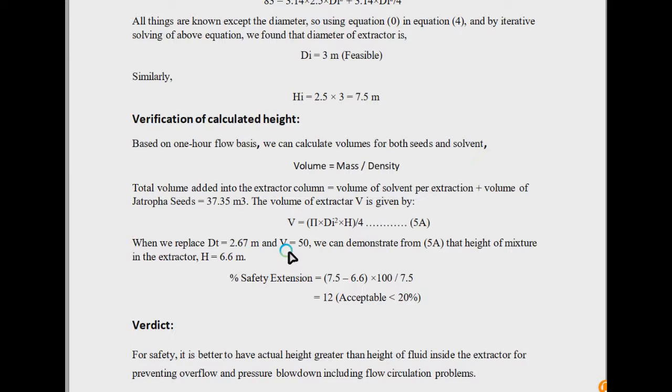First of all, for the extraction, you have this relation: the concentration of oil extracted at any time for each experiment, based on the equilibrium concentration, is calculated using this relation. Yt is equal to Cl times the volume of solution, the solvent volume Vsol, divided by m naught, and m naught is the total oil mass in the sample, multiplied by 100. The oil mass in each sample was calculated to be equal to this, where MAM is the dry mass of the sample with moisture content.